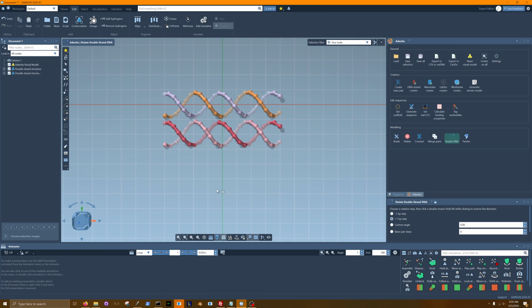So these tiles have sticky ends, and those are short strands of single strand DNA at the end. And those single strand DNA from one arm will combine with the single strand DNA on another arm, and that's how the tiles assemble into larger patterns. So to make that, what we're going to do is trim back one strand.